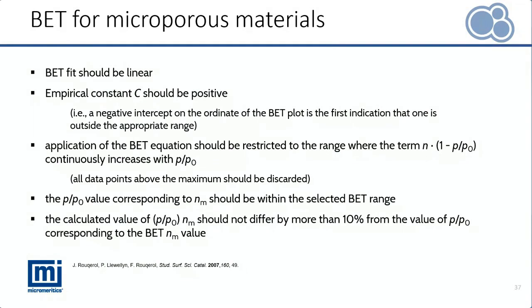I want to emphasize at that point that those criteria must be fulfilled actually for all BET calculations, not just in the case of microporous materials. It simply is the microporous materials where the classical BET range gives invalid results nearly all the time.